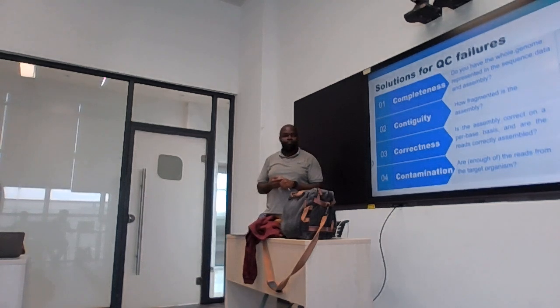Okay? Can you maybe just add that? Using different sets of barcodes for different runs.